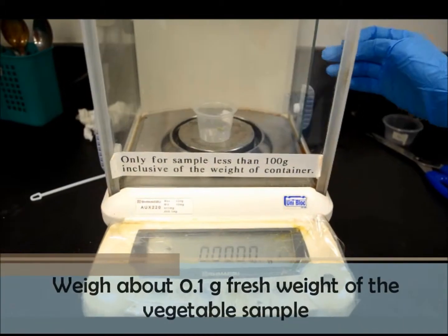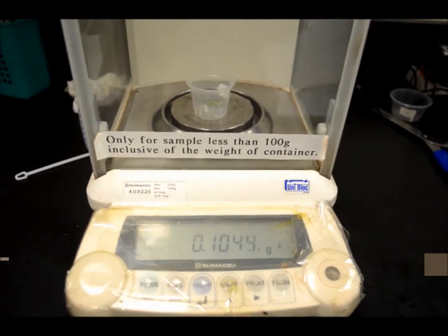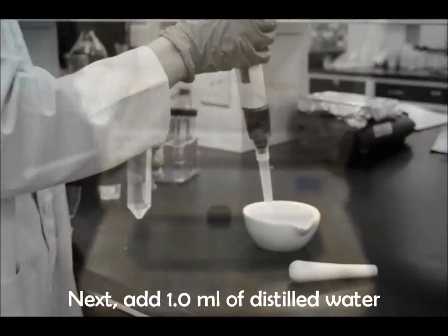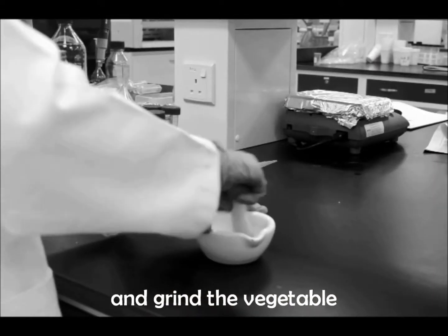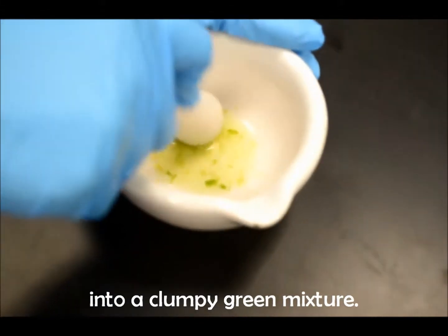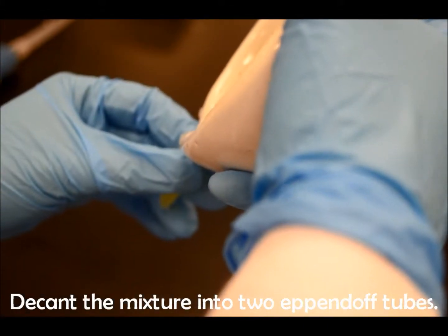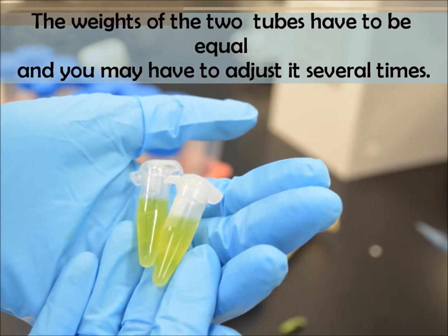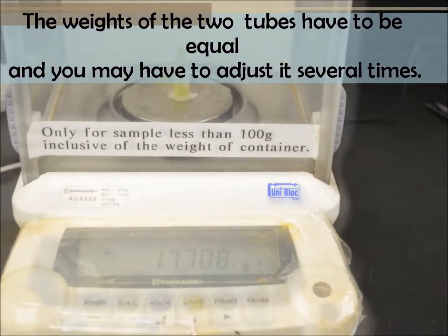Weigh about 0.1 g fresh weight of the vegetable sample. Next, add 1 ml of distilled water and grind the vegetable into a clumpy green mixture. Decant the mixture into 2 Eppendorf tubes. The weights of the 2 tubes have to be equal and you may have to adjust it several times.